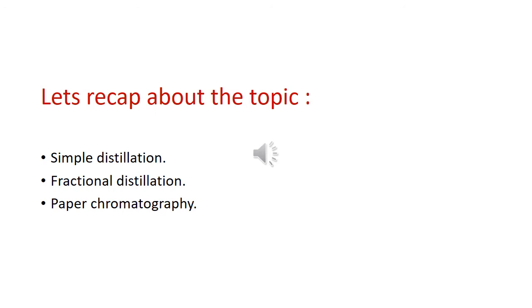Today we will learn a few topics in chapter 1, experimental techniques. The topics are simple distillation, fractional distillation and paper chromatography.